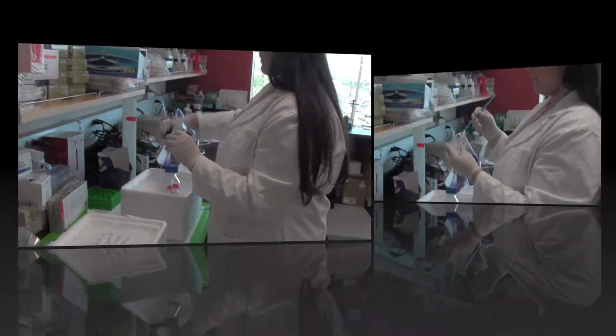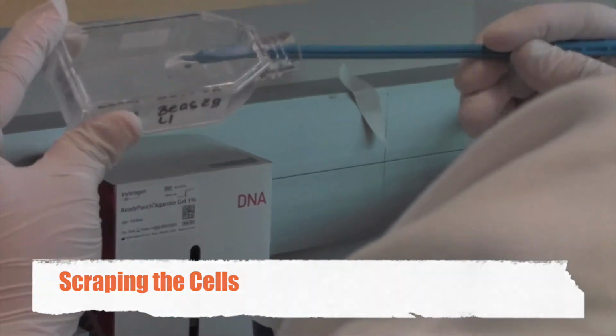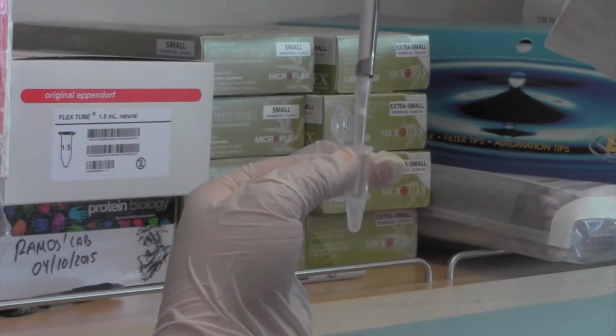Once the cells are lysed, we then use a scraper to scrape the cells around the container and set them to the bottom. This step is to assure we collect as many cells as possible. We extract the cells from the flask and transfer them into a test tube to further prepare our samples.